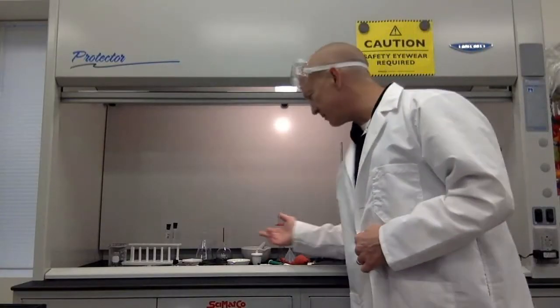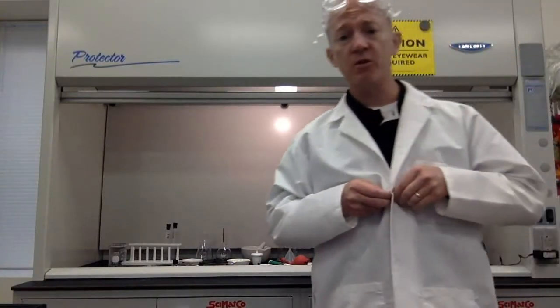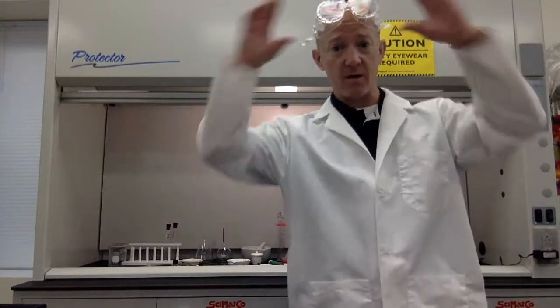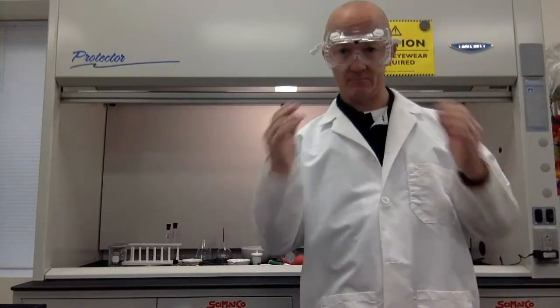Today we're going to be talking about all the different types of equipment that we're going to be using in the laboratory, and we're going to finish with talking about safety. Here we go.